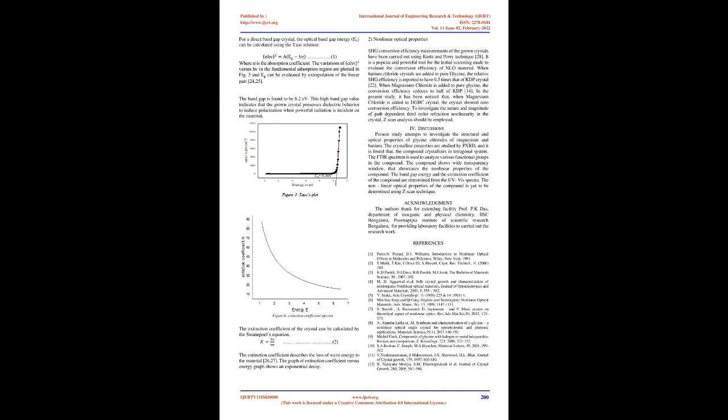1104.89 cm⁻¹ and 1441.72 cm⁻¹ respectively. In the same manner, the other peaks at 1481.85 cm⁻¹, 2710.01 cm⁻¹ and 3417.56 cm⁻¹ are attributed to NH3+ group and CH2 and NH stretching vibrations respectively, from a comparison of the spectra with that of glycine 23.